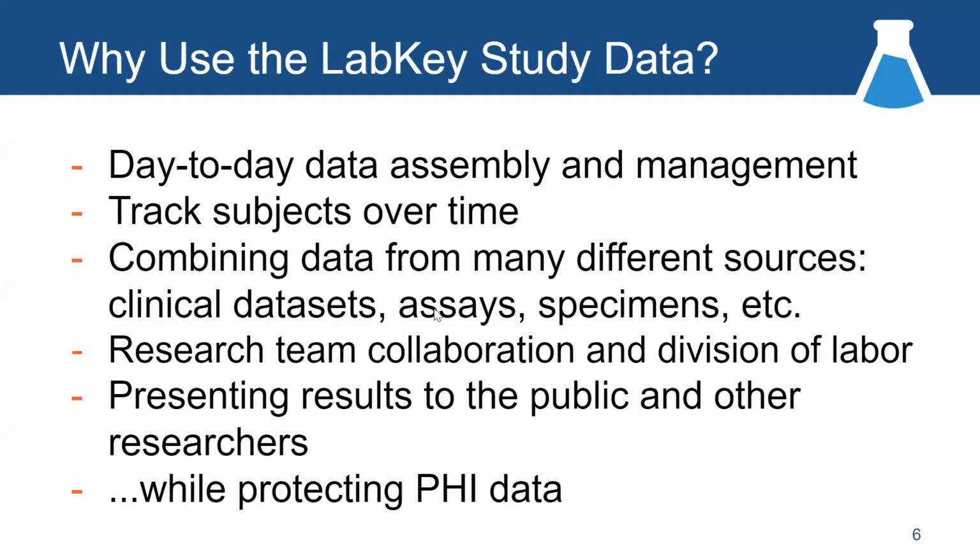So a quick overview around LabKey study features. Why use LabKey for your study data? And when I say study data, I really mean a pretty broad cross-section of research. Sometimes people call these observational studies, longitudinal studies, research studies.